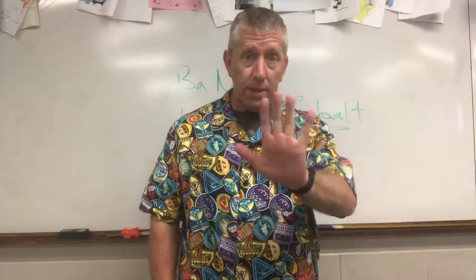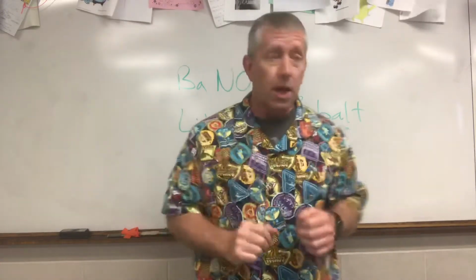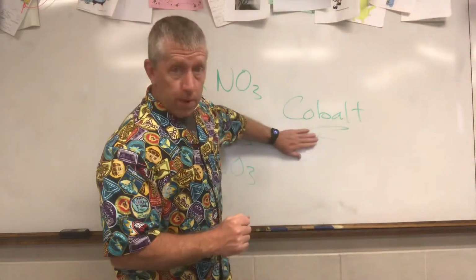And so what you're seeing is the emission spectrum, that blue light coming out. That's why you see something as red: you only see the red color coming to your eyes. The other colors get absorbed. So that's a hint as to why you see what you're going to see when you look up the cobalt color.